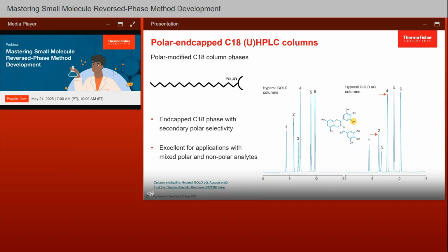They have a hydrophobic core structure due to the aromatic ring, but they also have polar hydroxyl groups, which contribute to their polarity and hydrogen bonding interaction. The hydrophobic column can interact with the hydrophobic core of the molecule, but we can improve the polar interaction by adding a polar modified column. We can clearly see the change in retention time due to the change in selectivity, but we also notice an improved baseline resolution, as now we are able to utilize the hydrogen bonding interaction with the polar modified column. When developing a new method, it is important to understand the molecule of interest and to explore different selectivity to fine-tune the chromatography to get the best result for your sample.